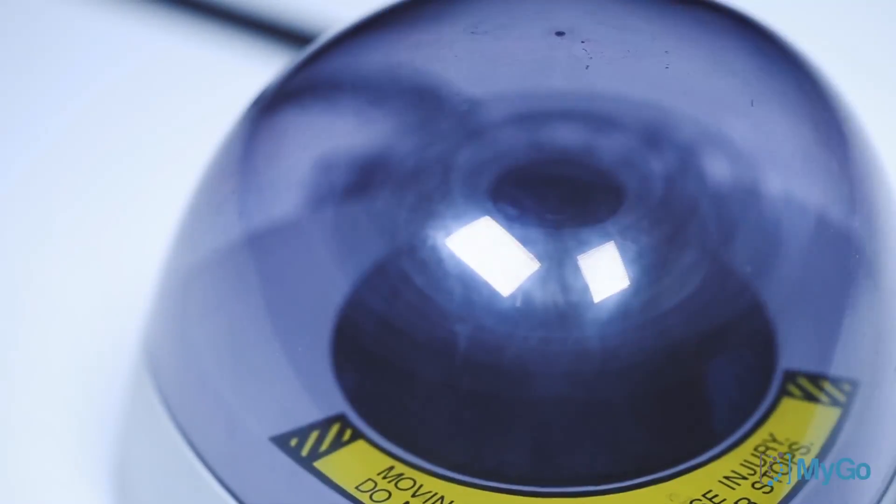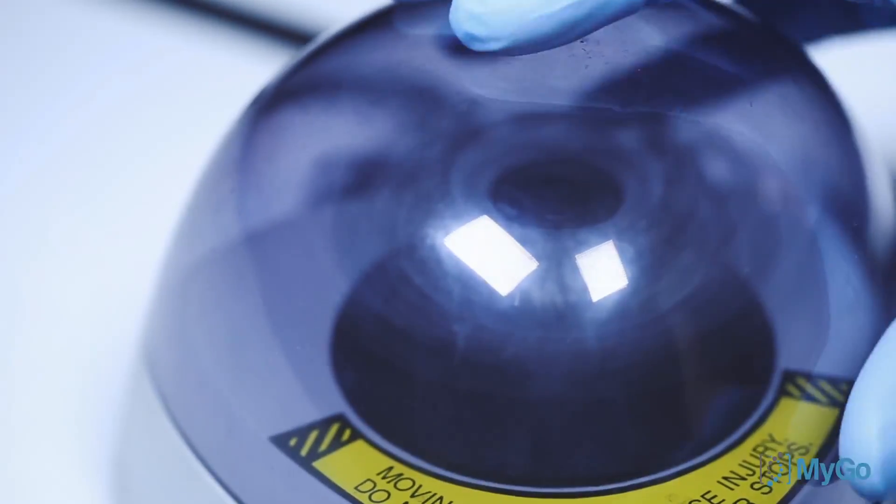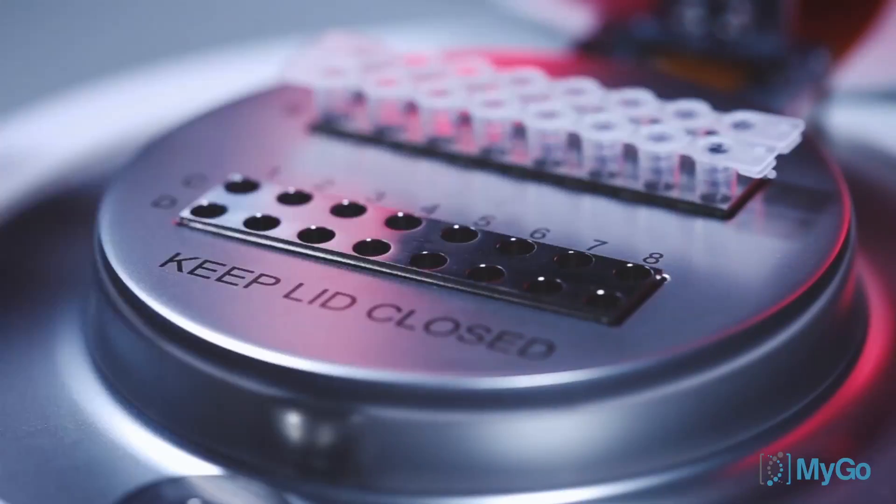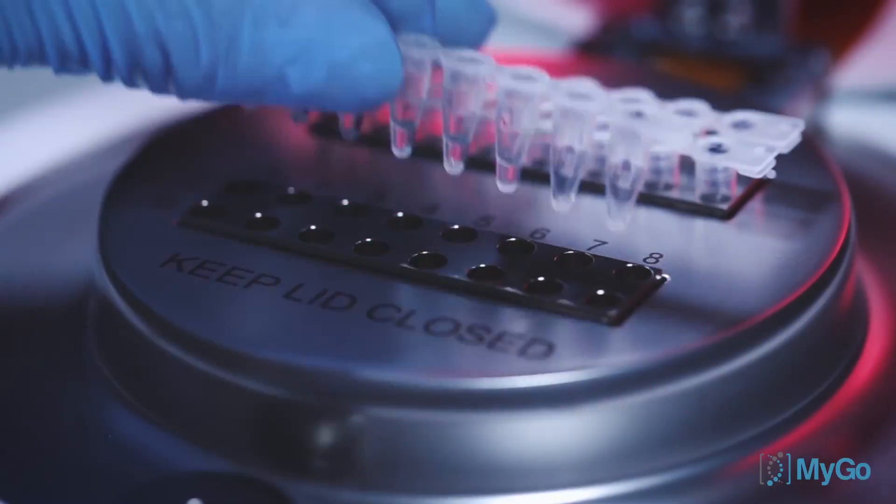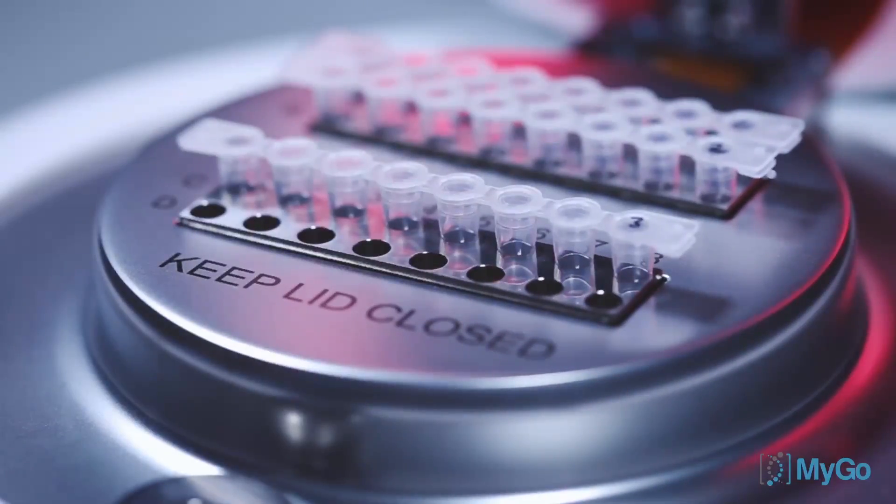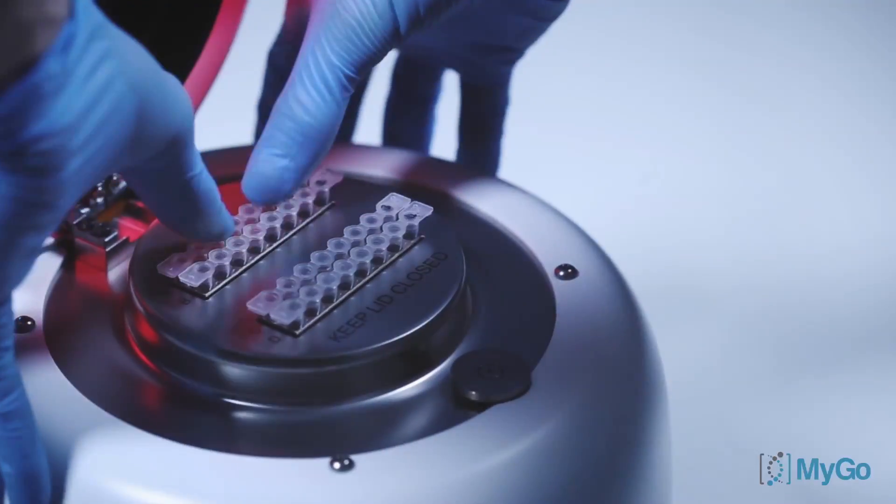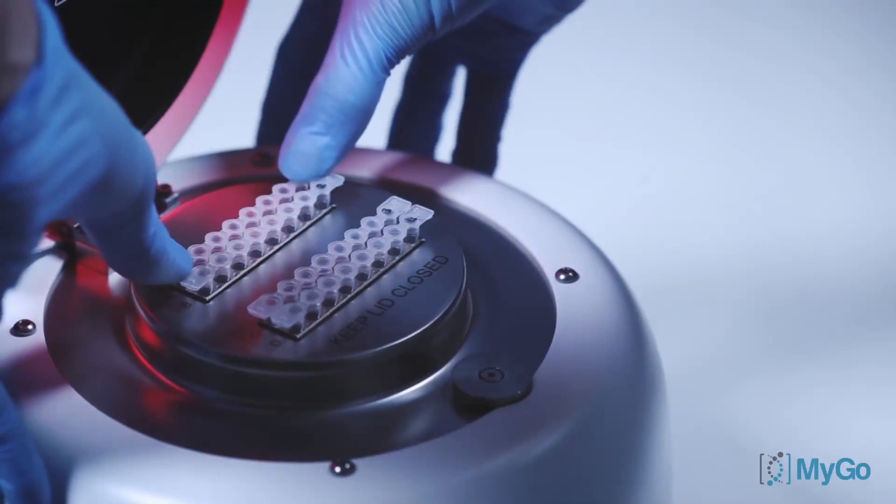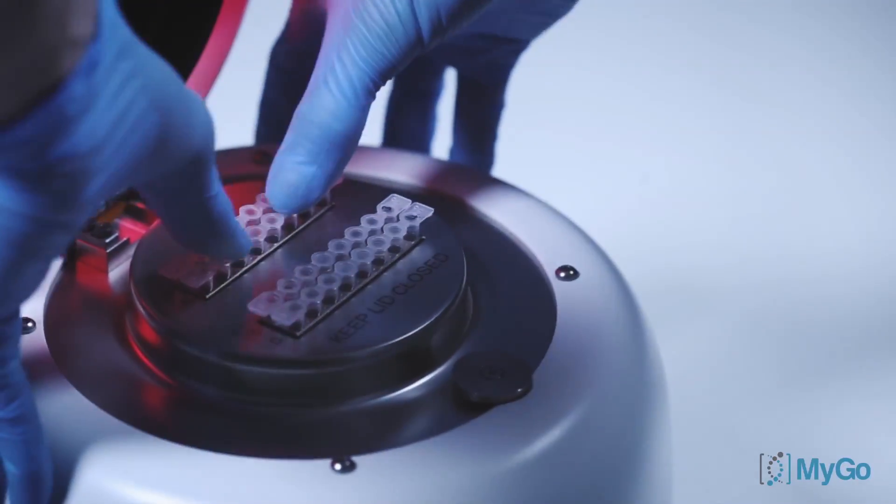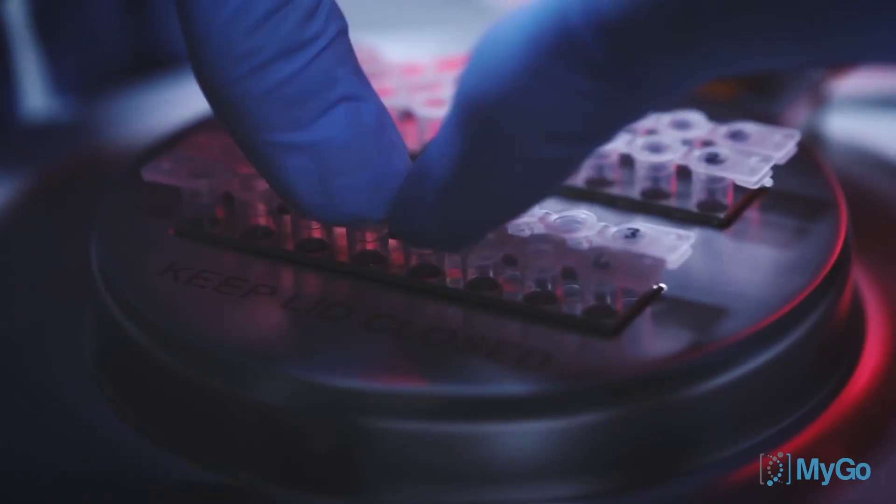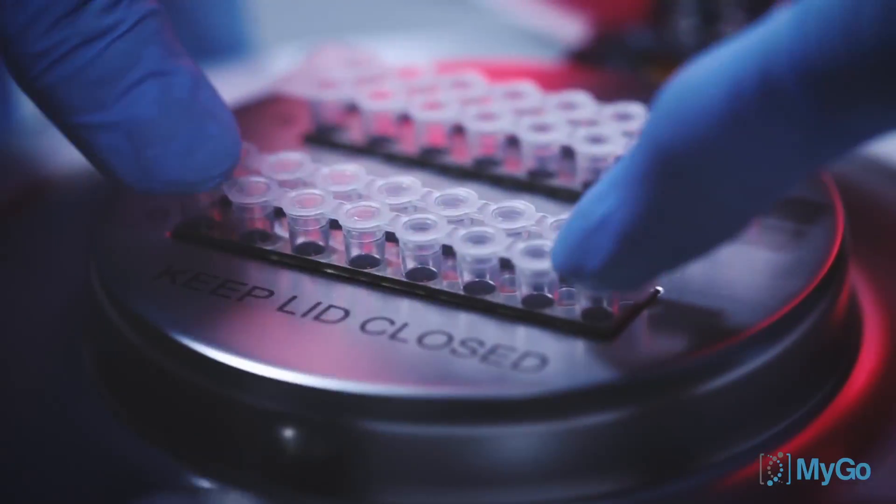Remove bubbles by centrifuging down the strips. Load the tubes into your MYGO Pro. Press down to ensure a secure fit. Close the lid until it locks and you're ready to begin your experiment.